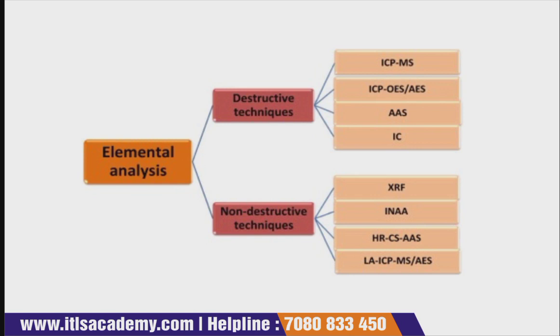For example, AAS means atomic absorption spectroscopy. XRF is X-ray fluorescence spectroscopy. All these techniques, whether destructive or non-destructive, we have already discussed in our previous lecture. So you can go to that lecture and get updated.